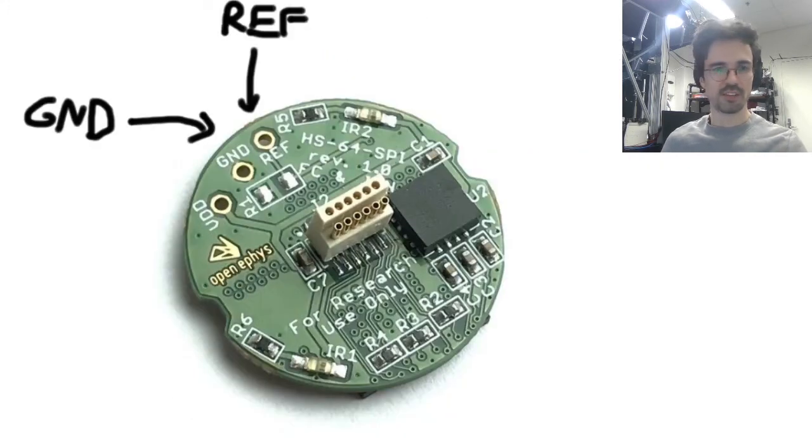So I hope this made sense, and next time you see the ground and ref inputs on your headstages, it makes a little bit more sense what they're there for.